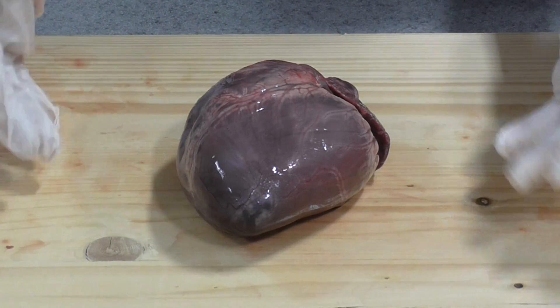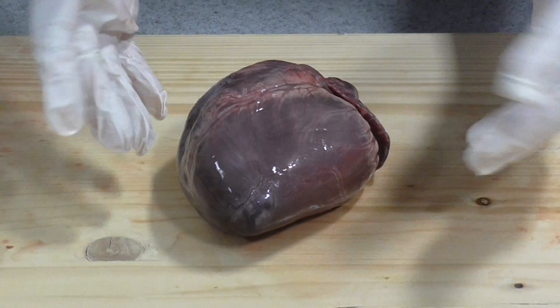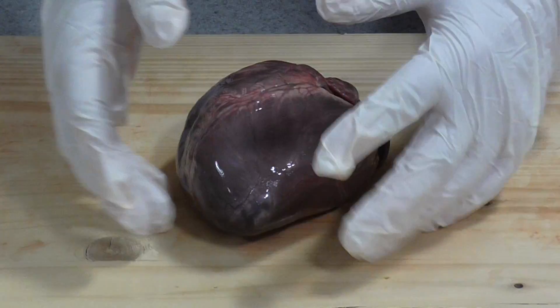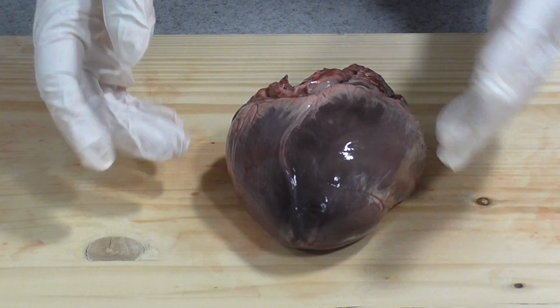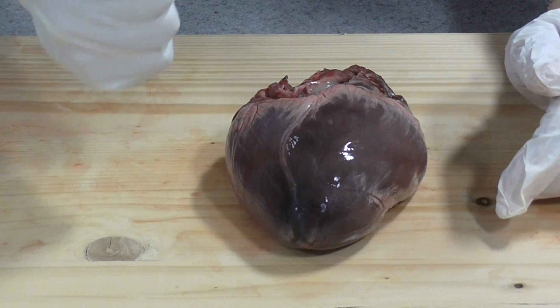I'm going to show you one of the A-level and AS-level biology required practicals, which is to dissect the mammalian heart. This is actually a sheep's heart from quite an adult sheep, as I can see by the size of it - slightly larger than a human heart. As you know, your heart is usually about the size of your fist.